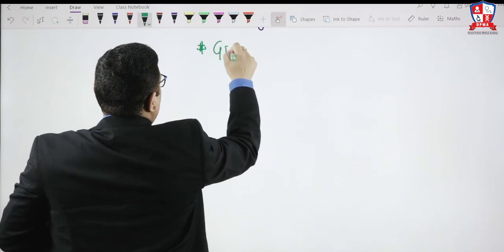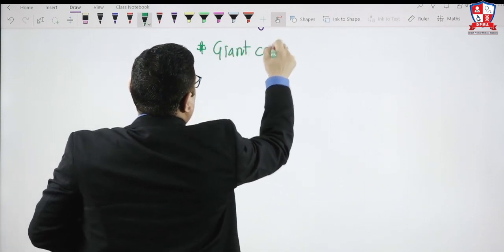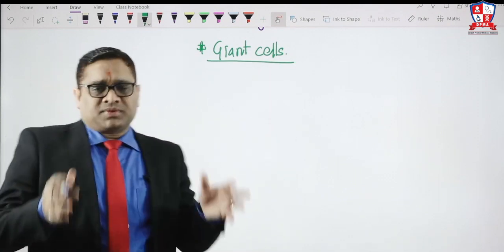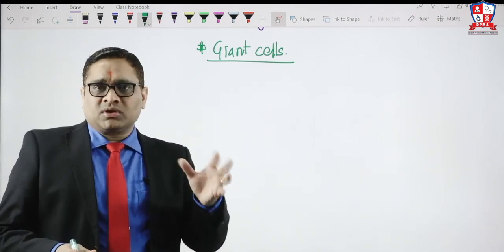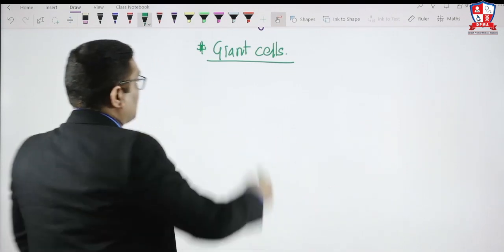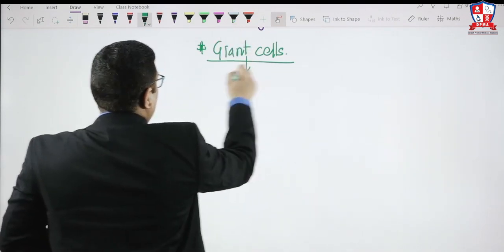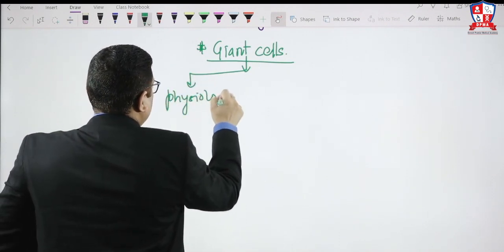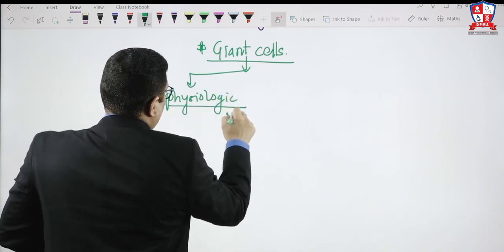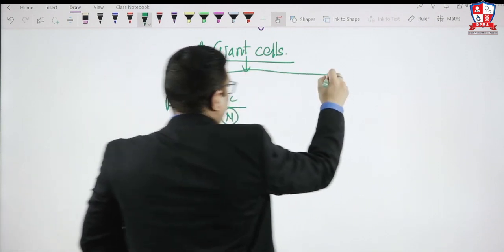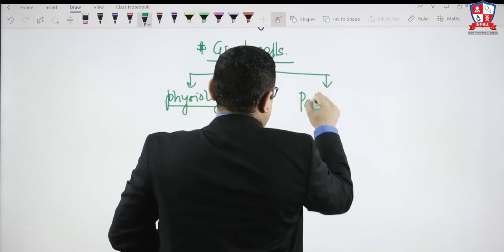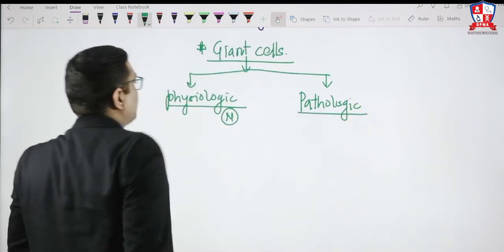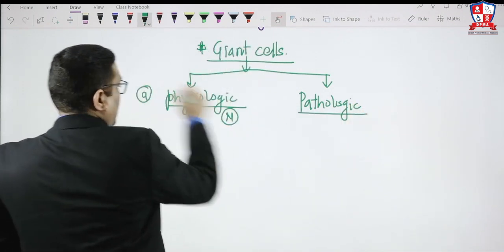This is an important point to understand when discussing giant cells. In our human body, we have two types of giant cells: one will be physiological and one will be pathological. Physiologic giant cells are normally present in the human body, while pathologic giant cells are seen in pathology only. These are the two types of giant cells.